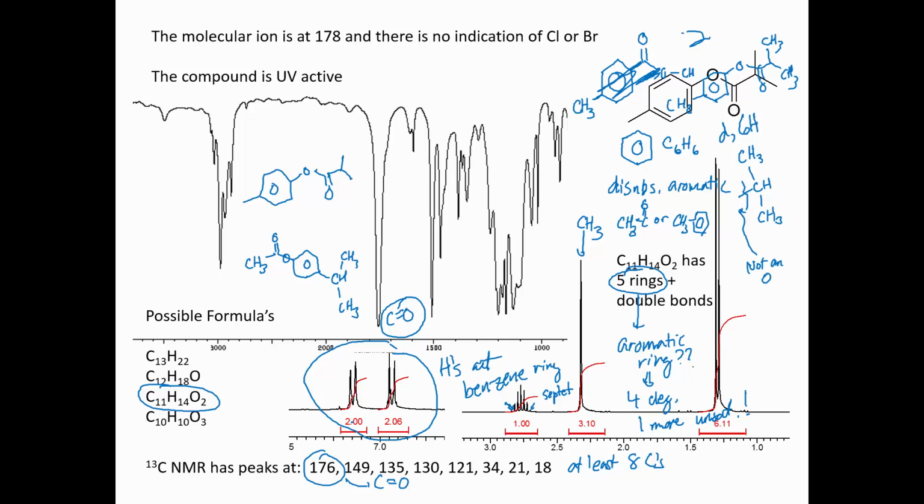Okay, all right, so these two structures would fit. This is the actual structure, but this alternate structure here, I can't see any reason why I should not count that. I should not give that full credit. Okay, there are more sophisticated ways to tell those two apart.